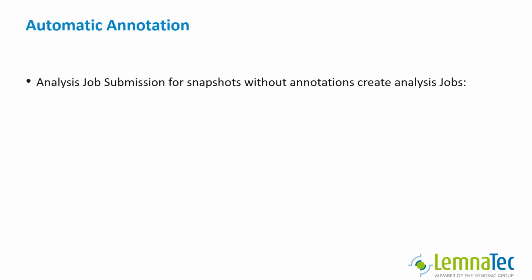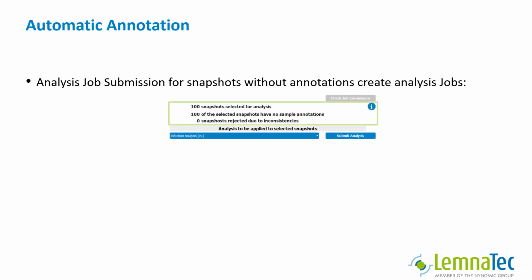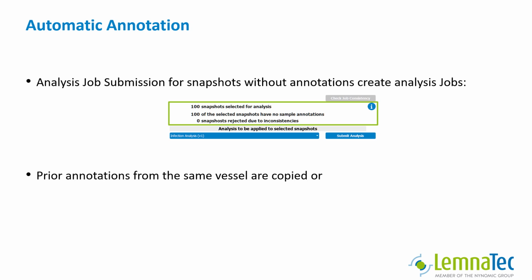If there are no annotations defined for a snapshot that you want to submit for analysis, then LemnaExperiment automatically creates them. This is done the following way. If there are prior annotations for the same vessel in the same experiment, these annotations are copied. This way you need to annotate only the first recording run. That is, unless you have annotations that change over time.